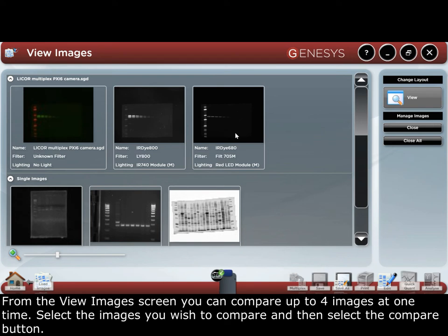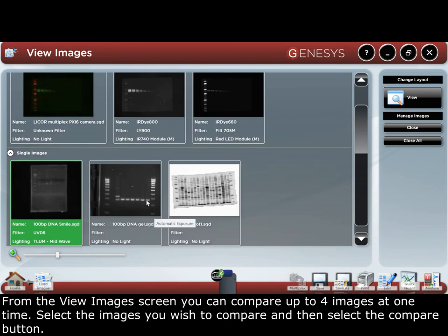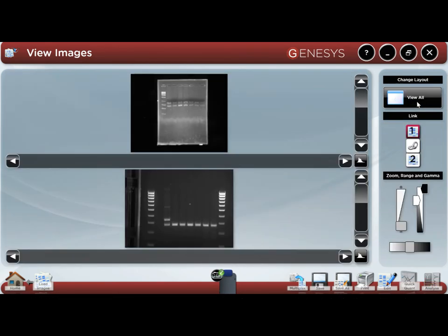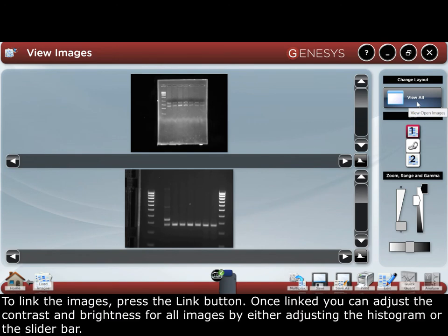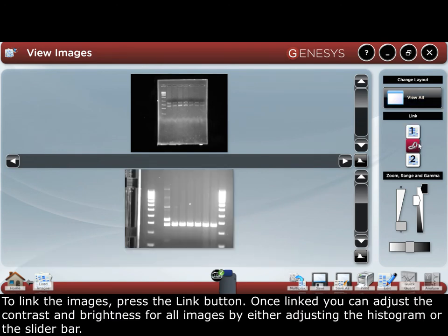Select the images that you wish to compare and then select the compare button. To link the images, press the link button. Once linked, you can adjust the contrast and brightness for all the images.